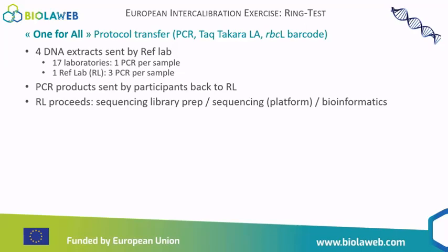And then the participants sent back the PCR products to our lab. And we, as reference laboratory, prepared the library for the sequencing. We sent them to sequencing platforms, and we did the bioinformatics.